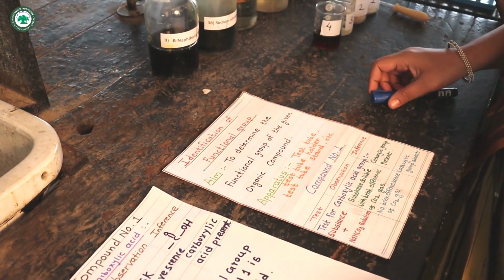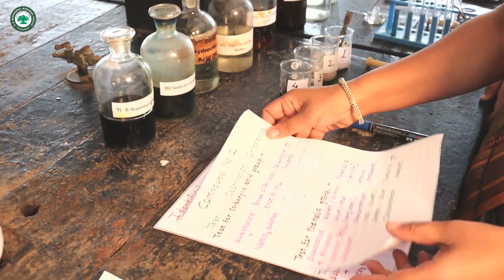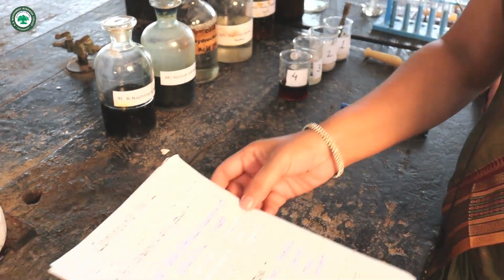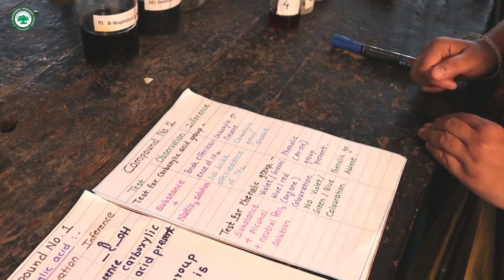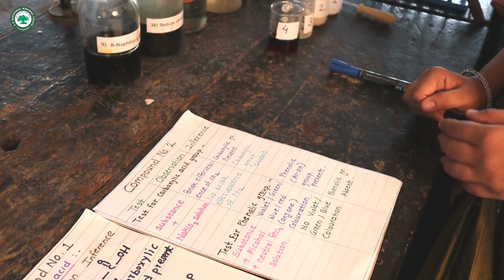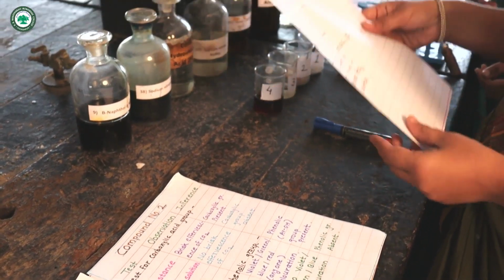Then we have to detect the functional group of compound second. For compound second, again the test for carboxylic acid is conducted.